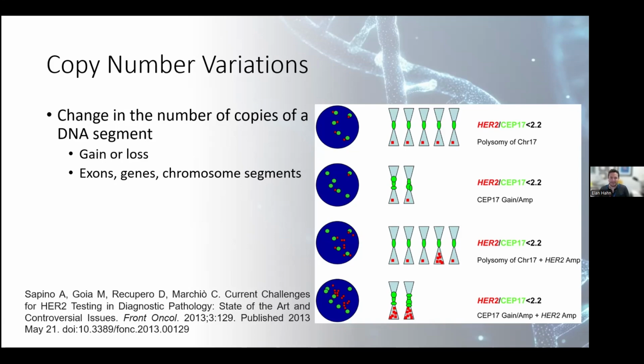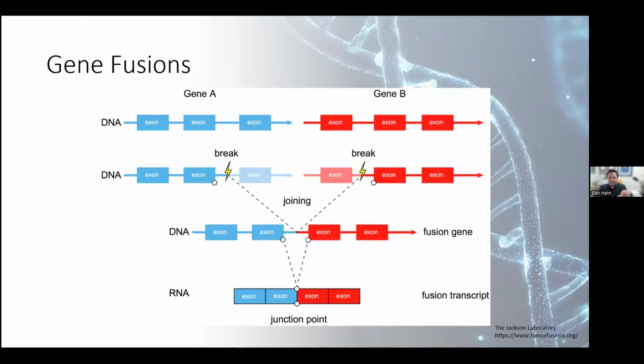Next, Dr. Fisher went on to cover gene fusions. This is when there's a breakpoint in 2 different genes that then join up to make a functional product. We also spoke about how a lot of these breakpoints are located in introns, which are quite large and difficult to sequence across, which is why DNA sequencing for fusions is not as easy to do as RNA sequencing for fusions, where we cut out the introns and are just looking at exons, which is much more manageable.